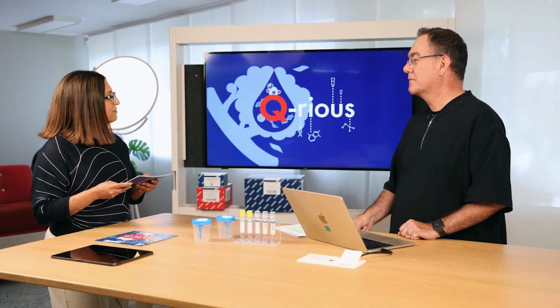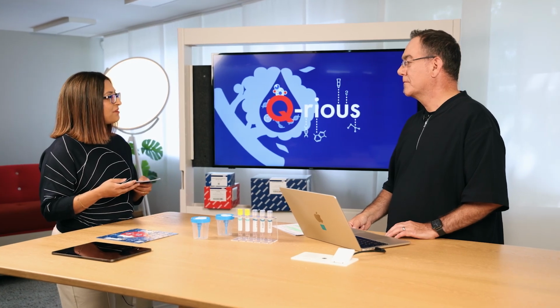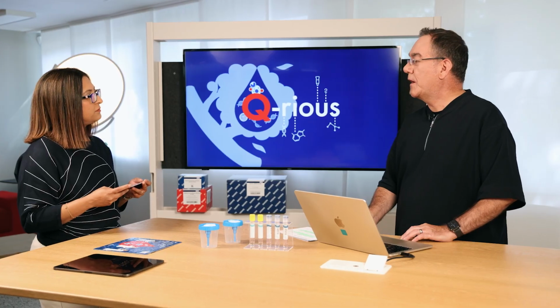So that about sums up the sample preparation for blood, but this shows about liquid biopsies in general. So can you share an example of a sample that is less invasive, something that you're developing in this direction? Yeah, absolutely. I think urine is actually developing into a very interesting analyte. Right. So we just launched a PAXgene liquid biopsy set for urine to isolate free circulating DNA.